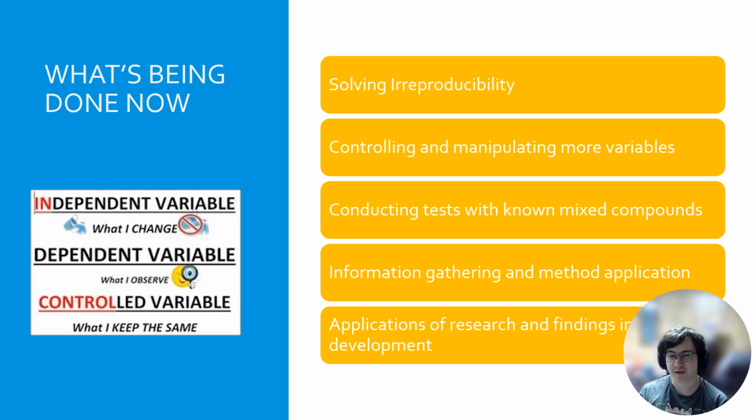So that would give me a good idea of whether it's sample prep that's affecting it, or if it's the machine peak area not working, or maybe it's just not reliably gathering on the fiber. But if they're being picked up at the same rate, then the fast SPME method might have more credence to it. I could use the average between the two and then use that for regression.